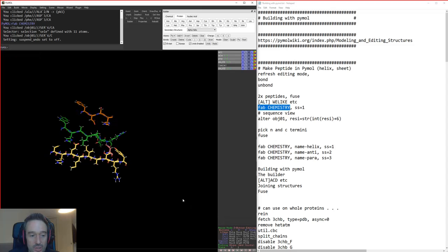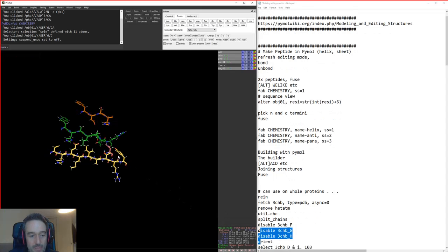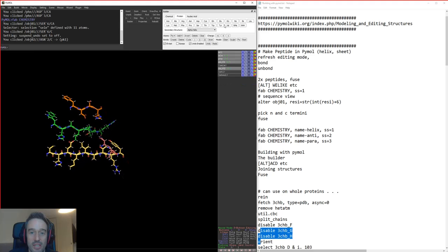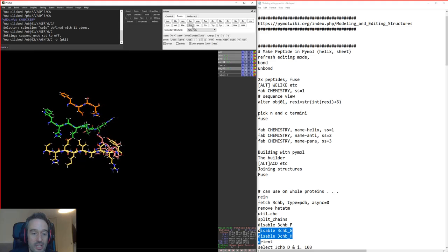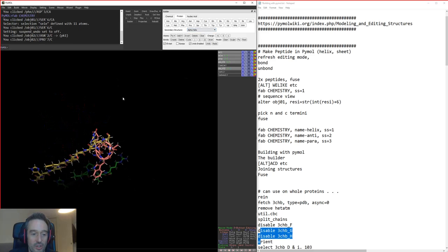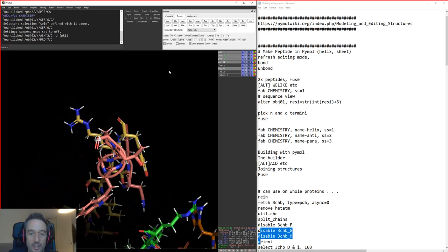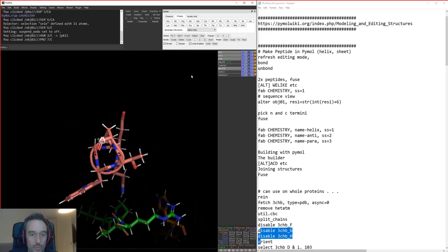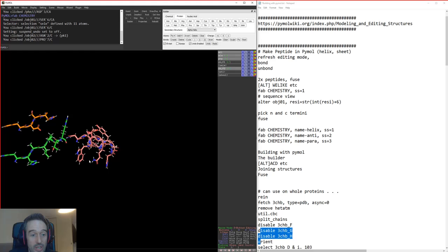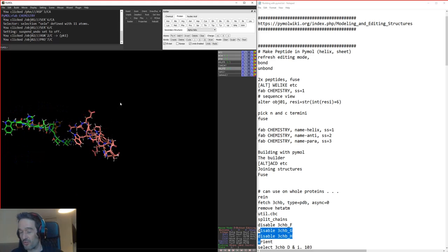And then say done. And again, if we've picked a particular termini, such as that one there, then we can just click residues here and build our sequence. Now, when you're building with the builder, you can also see there's a drop-down menu here where we can have alpha helix, beta sheet, parallel and anti-parallel, and you can see that because it was automatically on the alpha helix, we've started generating a generic alpha helix here with this particular extension of amino acids that we've put here. So that's also a very easy way to create different secondary structures as well.